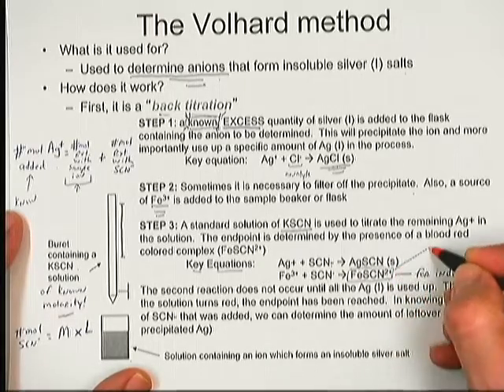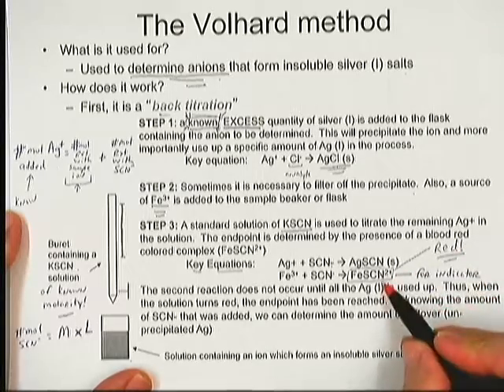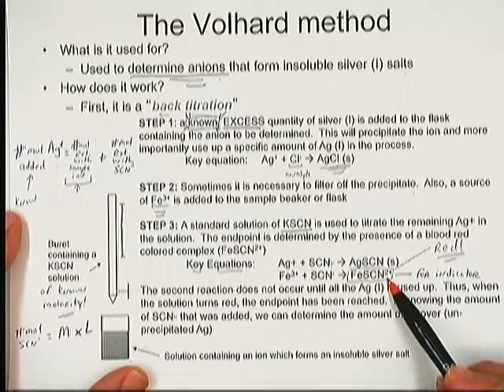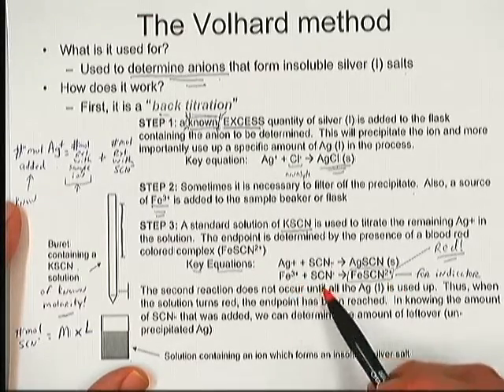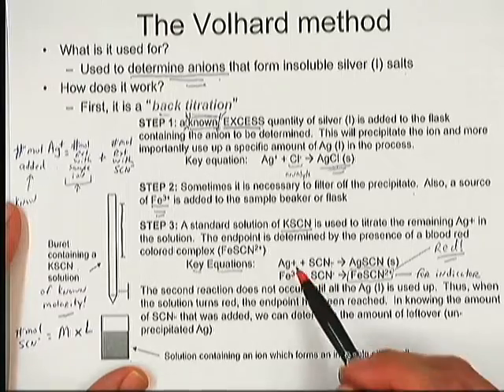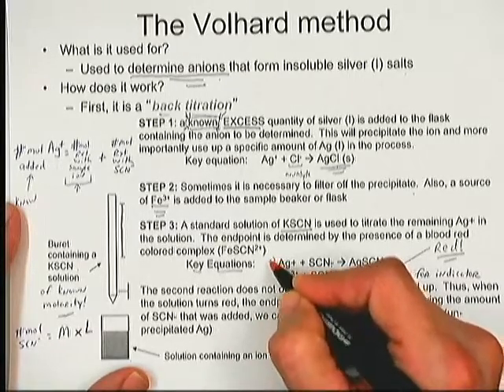It just so happens that that complex ion, when it's dissolved in aqueous solution, is a bright red color. So that actually serves as our indicator, that color change to a bright red color. And the beauty of this reaction with the iron is that the iron binds this ion less effectively or less aggressively compared to the silver. So it turns out that these reactions are sequential.